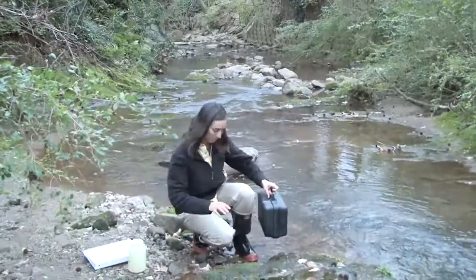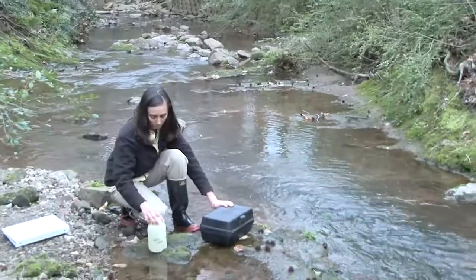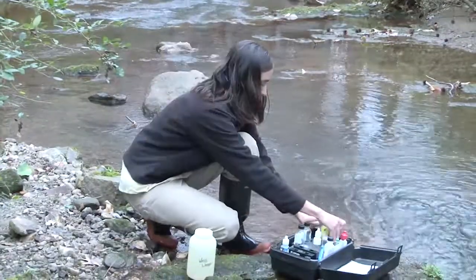There's the waste jar. She will pour all of today's sample water and chemicals into the jar when she's finished. Never pour them into the stream or on the stream banks. Now she reviews the directions card and checks her kit.